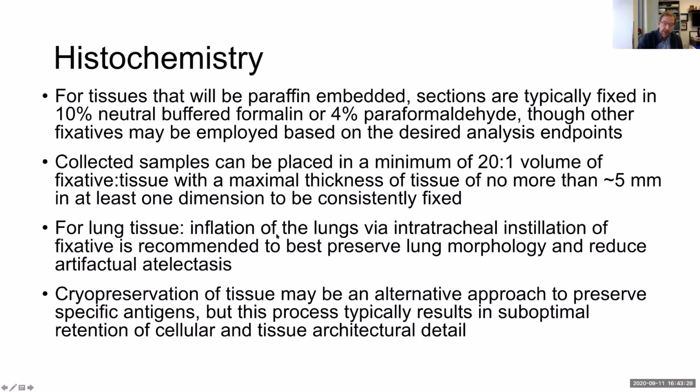With lung tissue, we generally try to do an inflation fixation and also perfuse the tissue to get the best morphology and not have artifactual atelectasis.